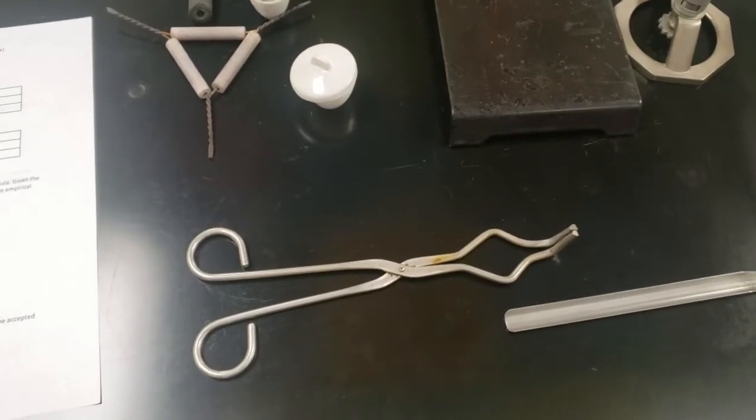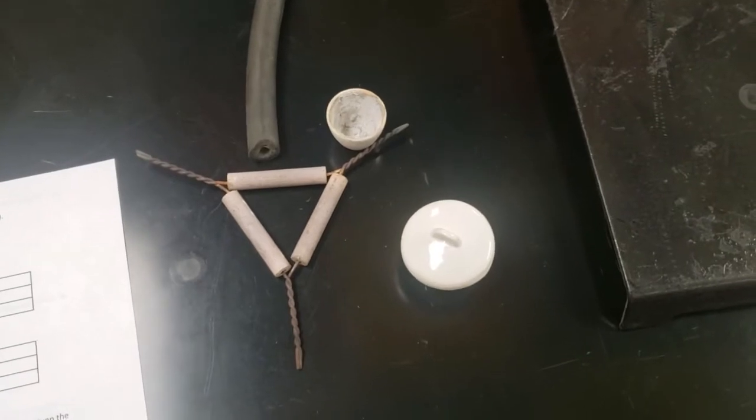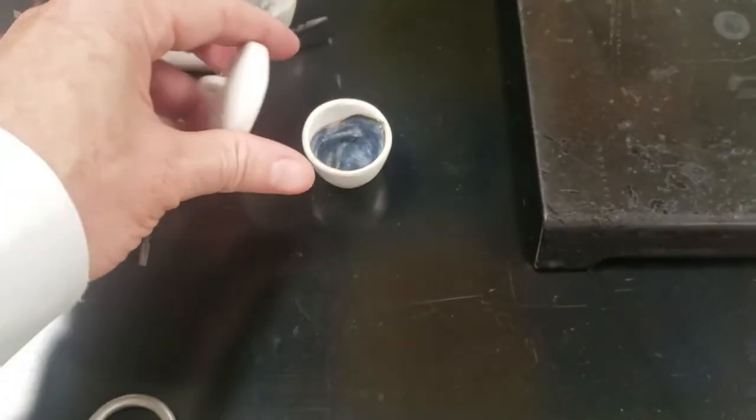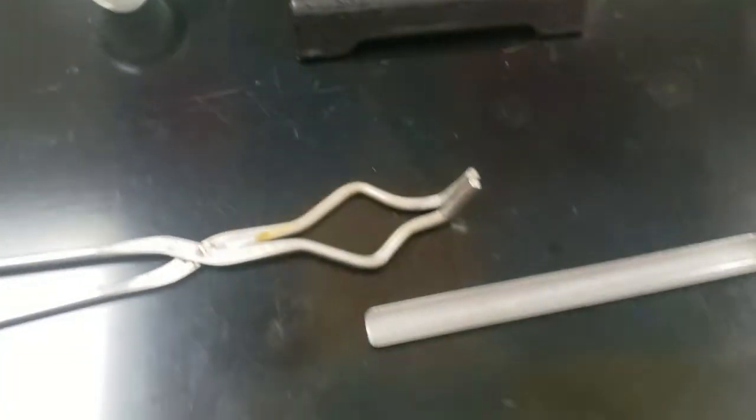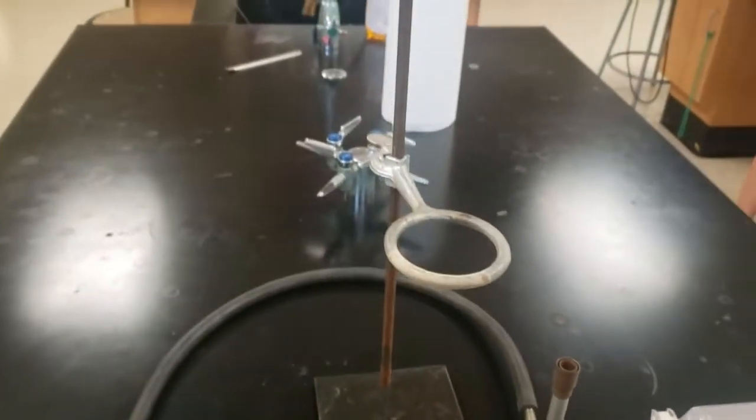Okay, today we're going to determine the empirical formula for silver oxide. Here is all the equipment that you need: tongs, ceramic triangle, crucible with lid, a scoopula, a burner, ring and ring stand.